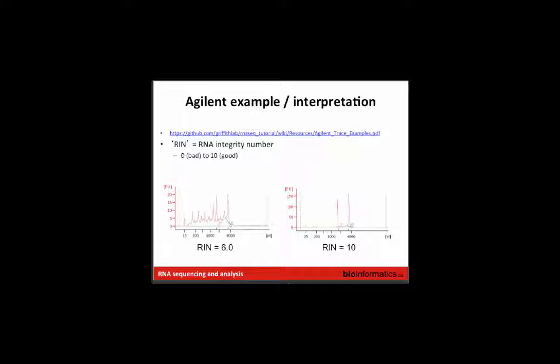35 or 36 or 42 or 50 bases, and that allows you to save reagents and to get basically more sequence out of each kit that you buy from Illumina. And then you can multiplex a lot of samples. So if you have a lot of samples or a lot of biological replicates and you really just care about differential gene expression, then you could do one of those strategies.